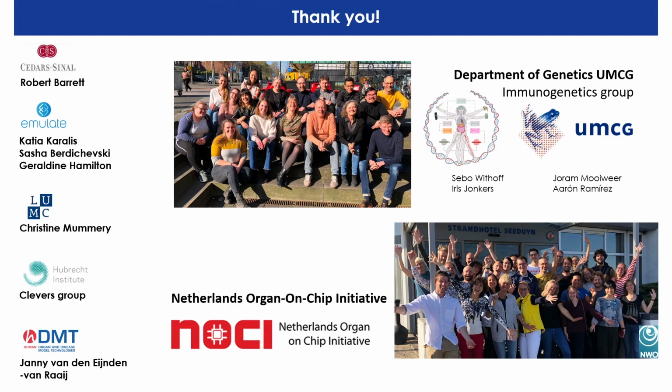Hello, excellent talk. I have two quick questions. I might have missed it at the beginning, but these two different media types that you generate that gradient of, what are the key distinguishers between those two types? And then from what I understood, you were able to separate the EpCAM positive cells, and that's what you started off with in your organoid. How does the viability of just culturing those epithelial cells look like, with different conditions, you mean then?